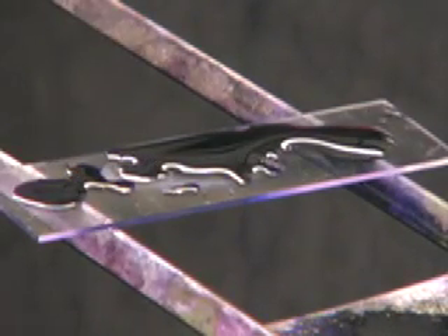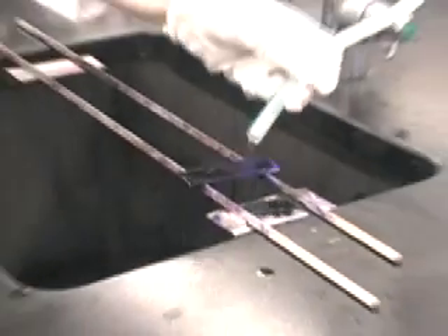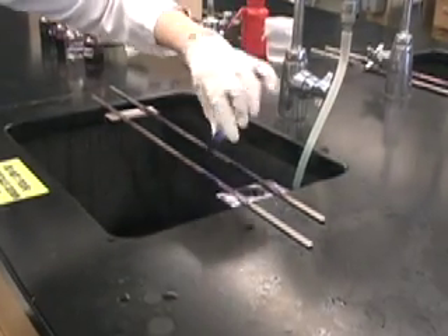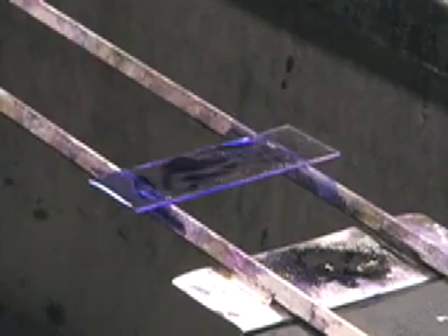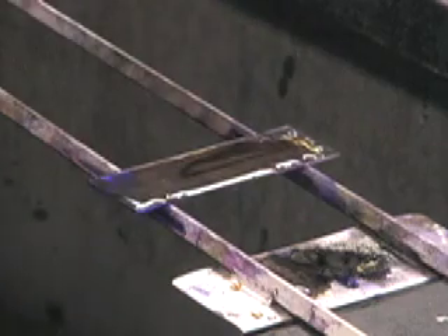The crystal violet has now been on a minute and you'll rinse the slide with water. Next you'll add Gram's Iodine to the slide and leave the Gram's Iodine on for 30 seconds.